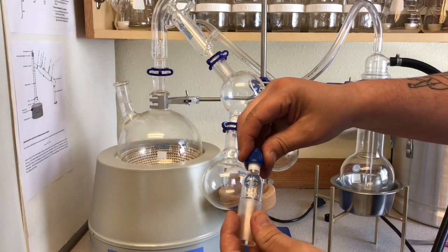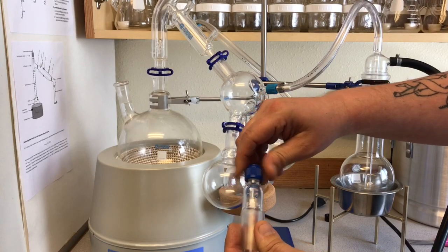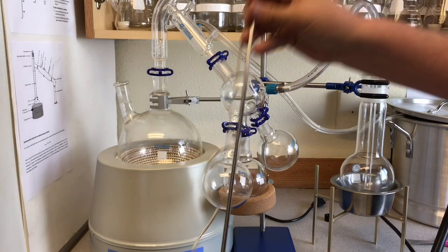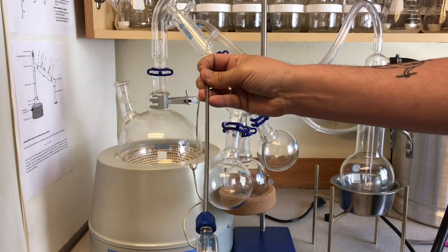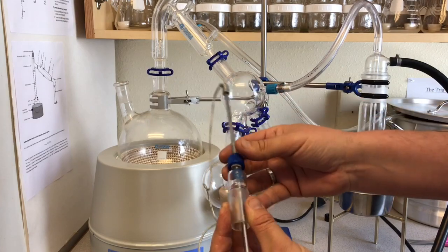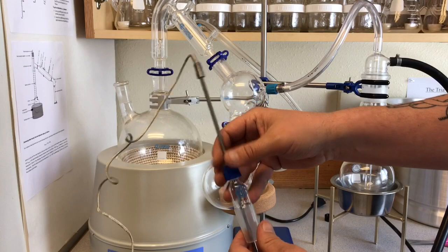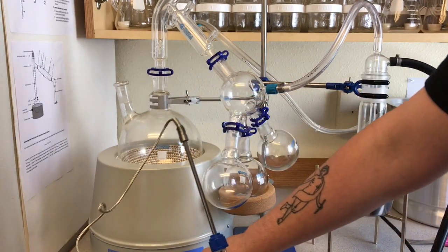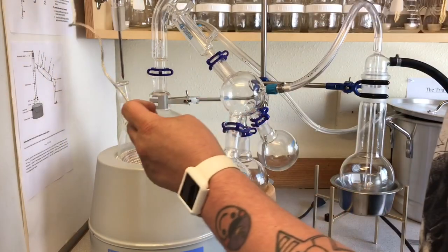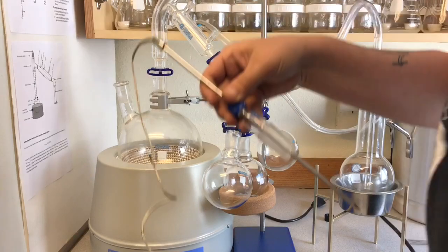So we'll start by screwing this cap on part way. And we'll take our thermometer probe and just gently push this in here. This probe is going to go all the way down into our material, and this is going to give us a digital readout of what our actual temperature is. And this goes down in this here, and this connects around the back.